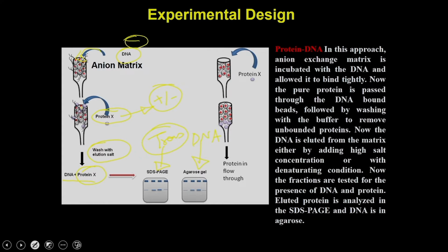So, if the transcription factor will bind to the DNA, or if a particular set of fractions are going to give you the binding, then the pattern of these proteins on the SDS-PAGE is going to match the pattern of the promoters. Okay.